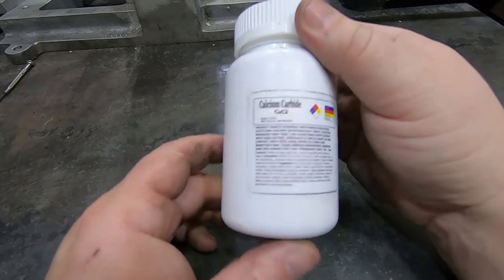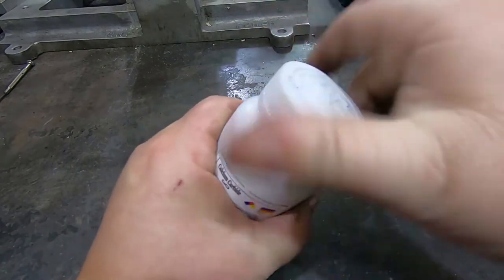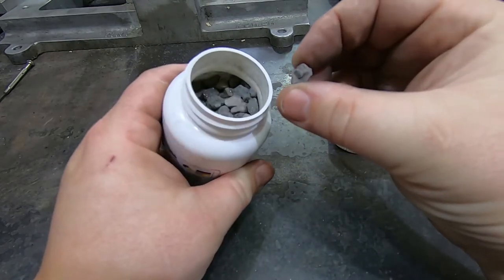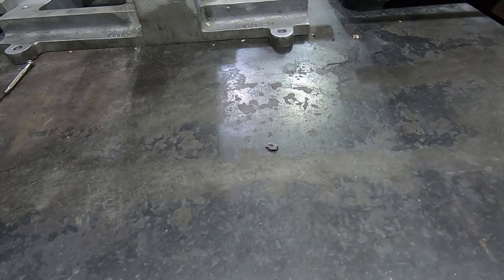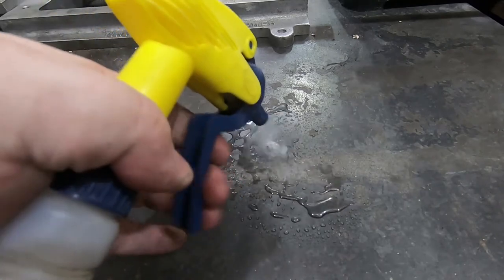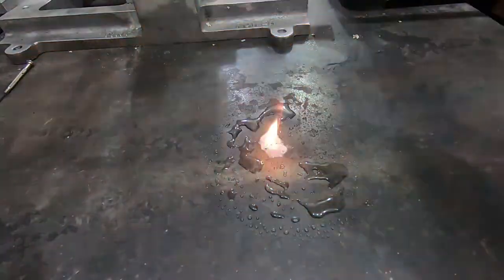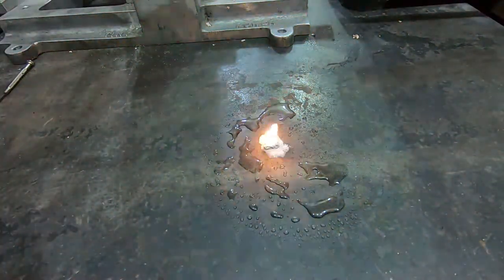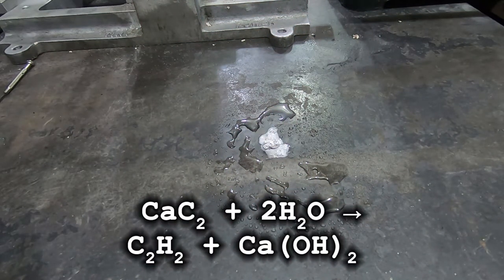Calcium carbide is basically just a rock, but it has a very interesting property: if you get it wet — see how it's fizzing up? — that's acetylene. It gives off acetylene when gotten wet, which is kind of cool, and also has some interesting applications historically.